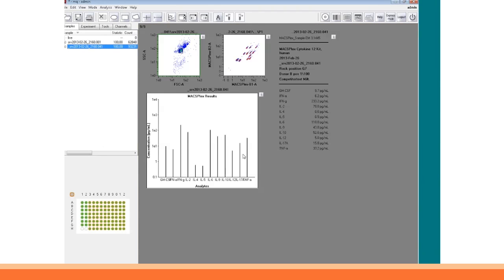And because I have grouped 9 different sample data files, I also get 9 different analysis pages. And by using these buttons, I can click through the pages and see the individual analysis of the sample positions, and I can print them all at once.